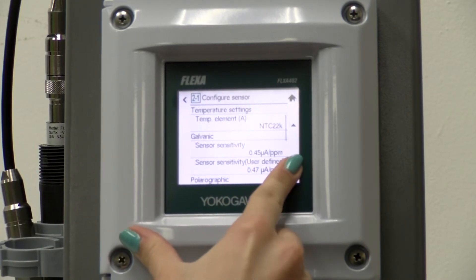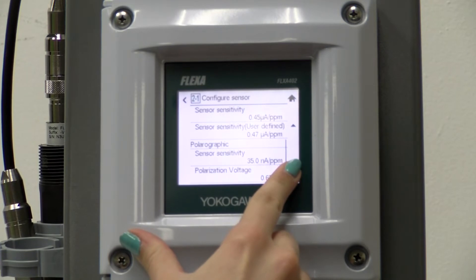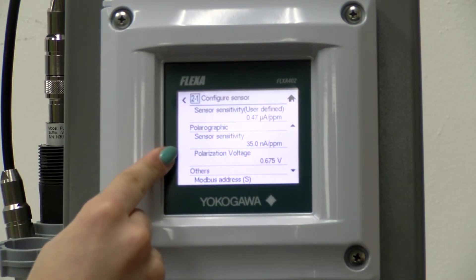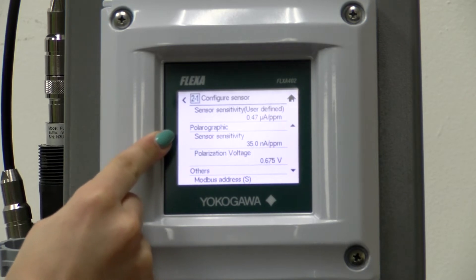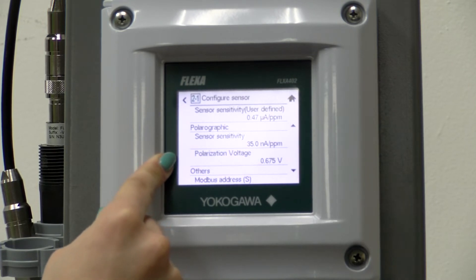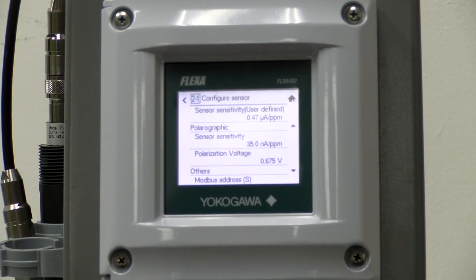Then we will scroll down and make sure that we have the correct sensitivity and voltage set. We are using 35 nanoamps per part per million and 0.65 volts. The sensor needs to sit for a minimum of 2 hours in order to fully polarize.